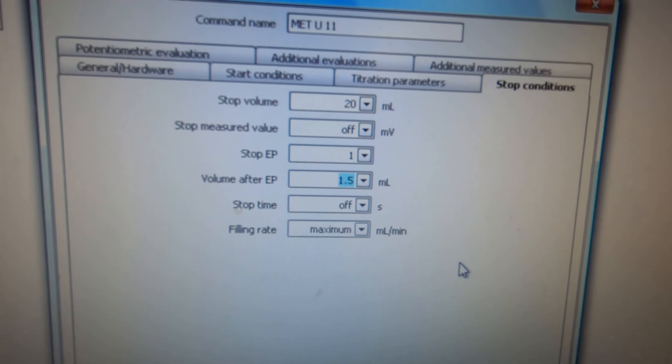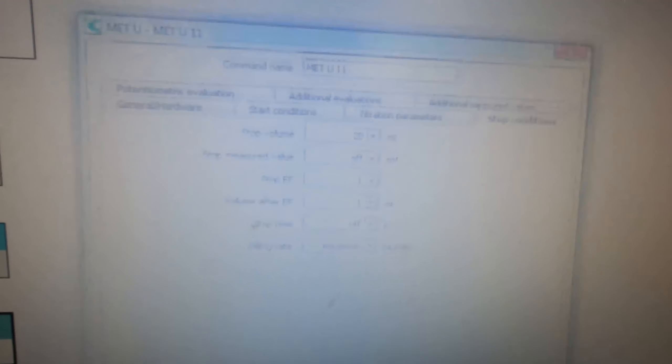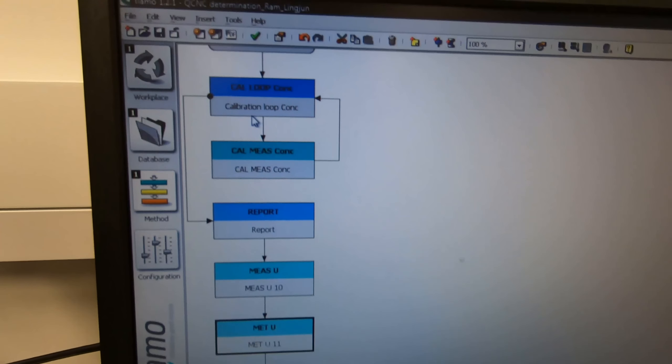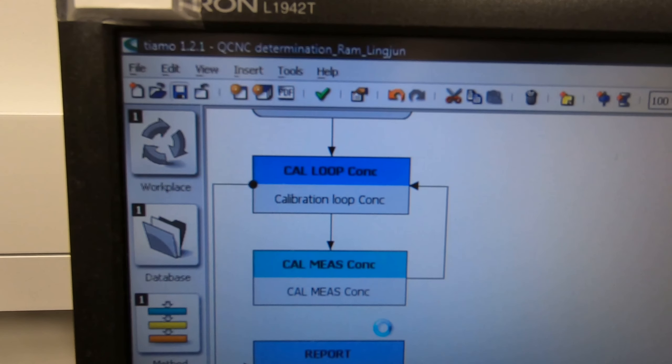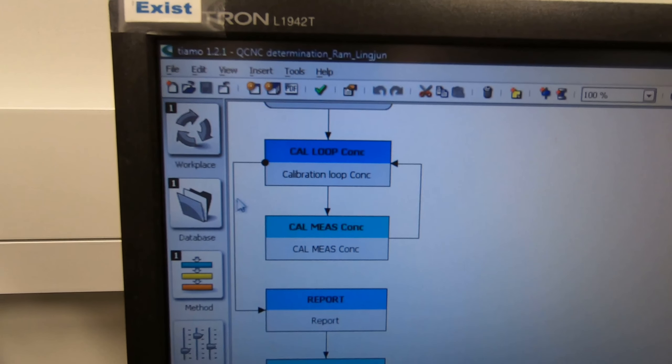It will run an additional 1.5 ml and then stop. If you want to change this you can change it to 1 ml. The stop volume - it will stop anyway, no need to worry about that. After that you have to save this method every time, then only will it take effect.